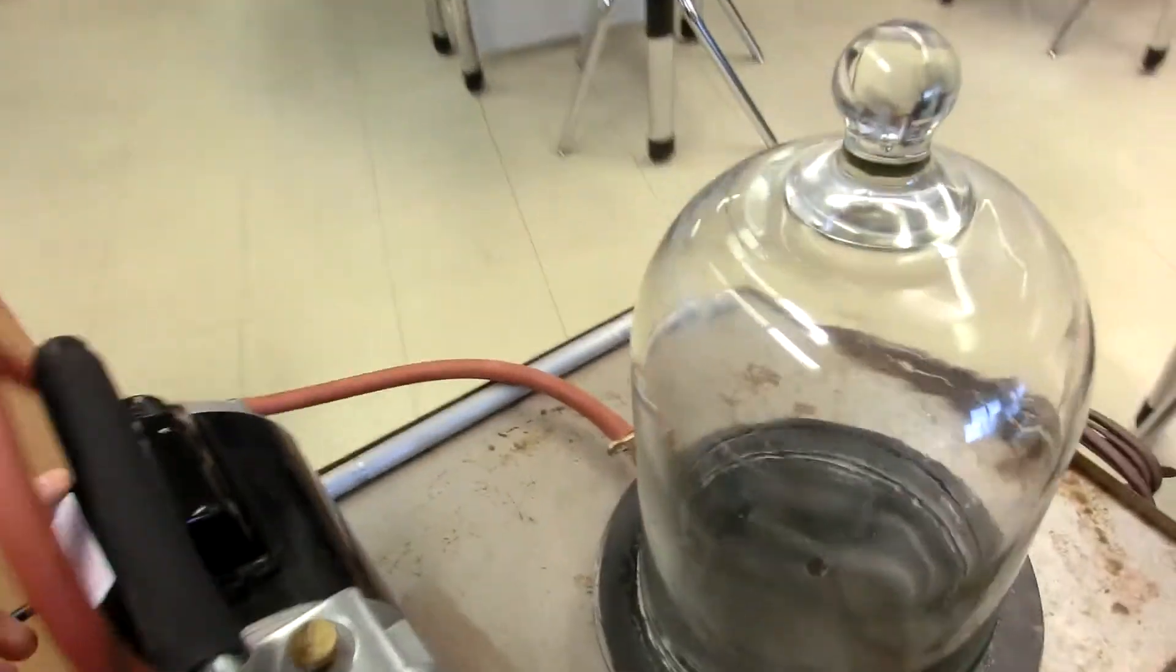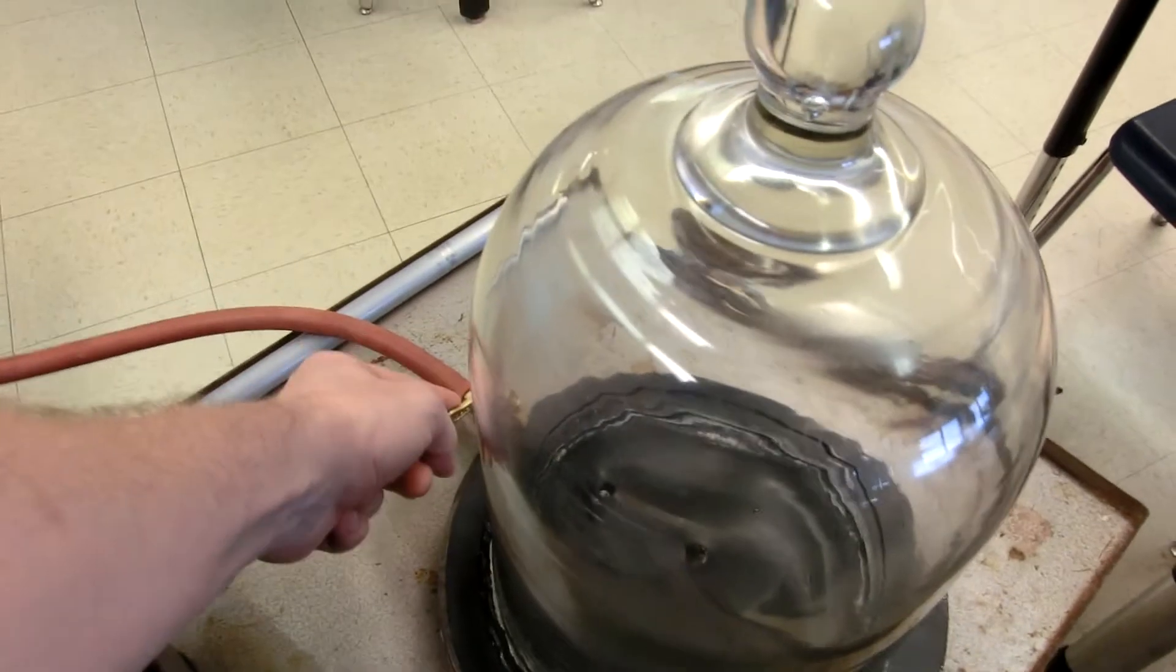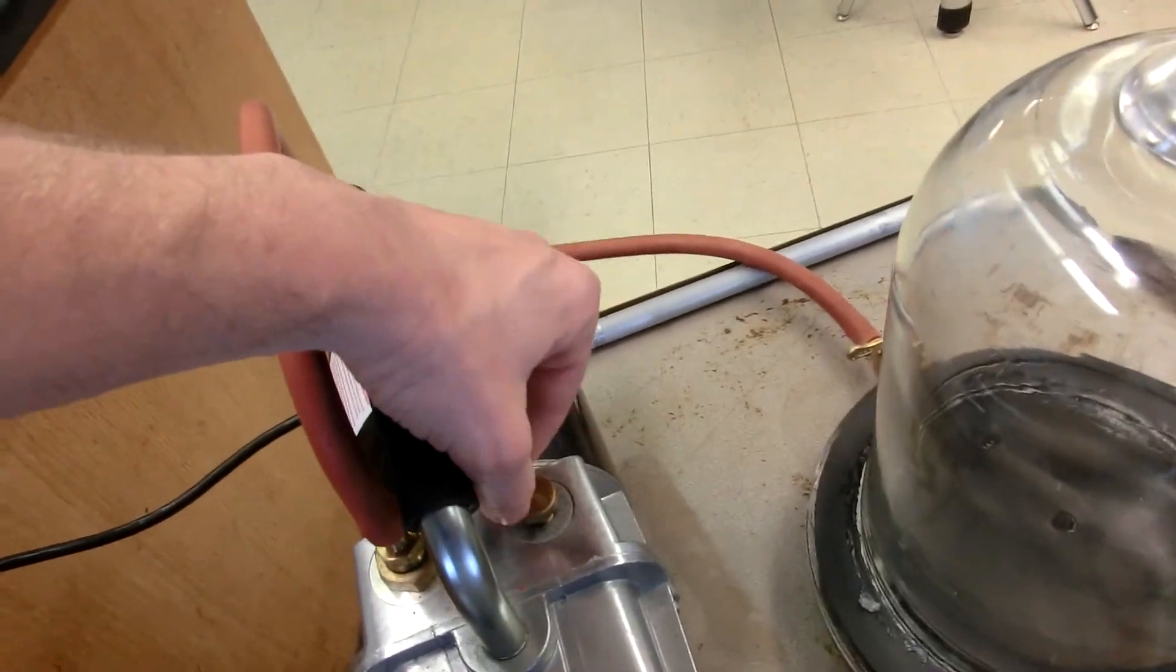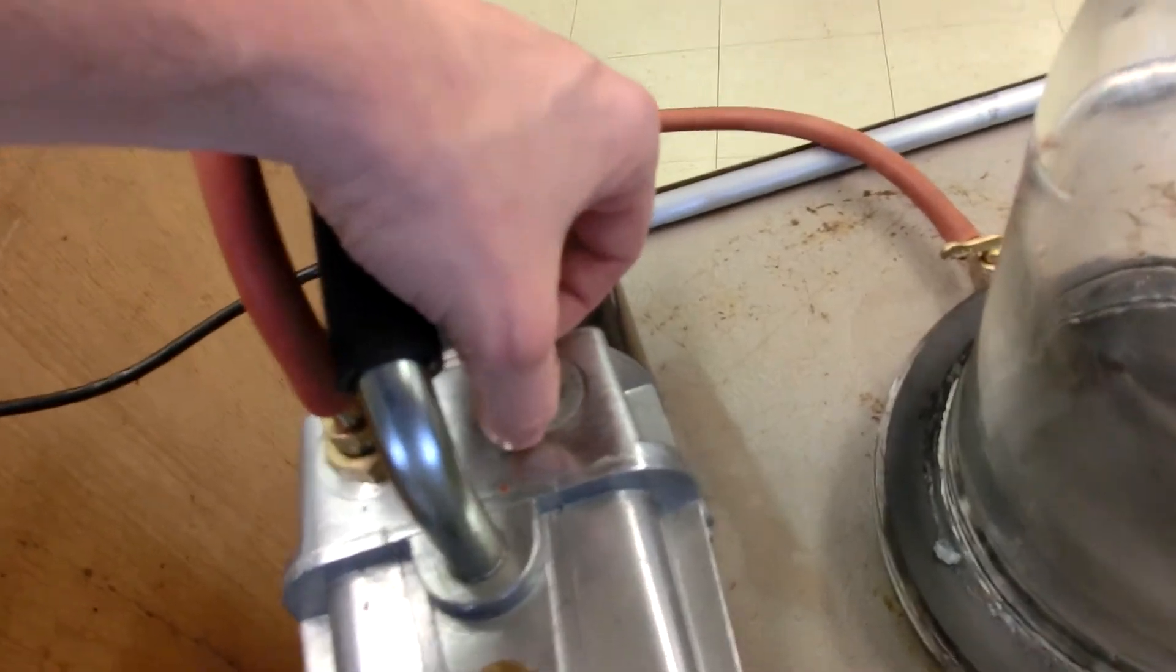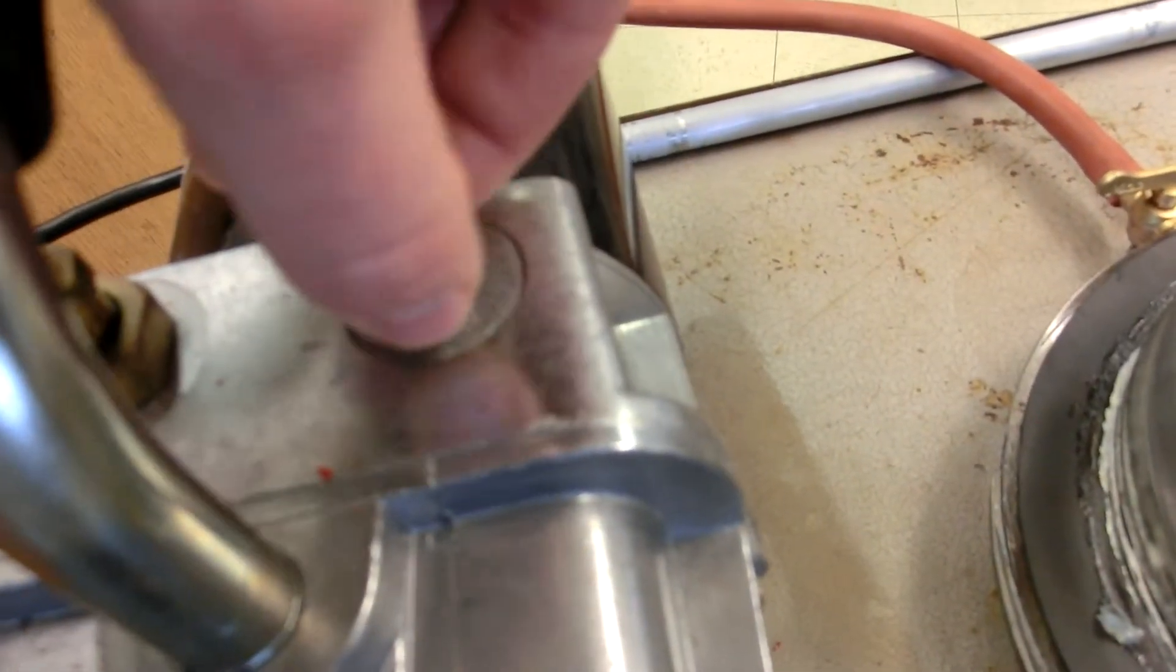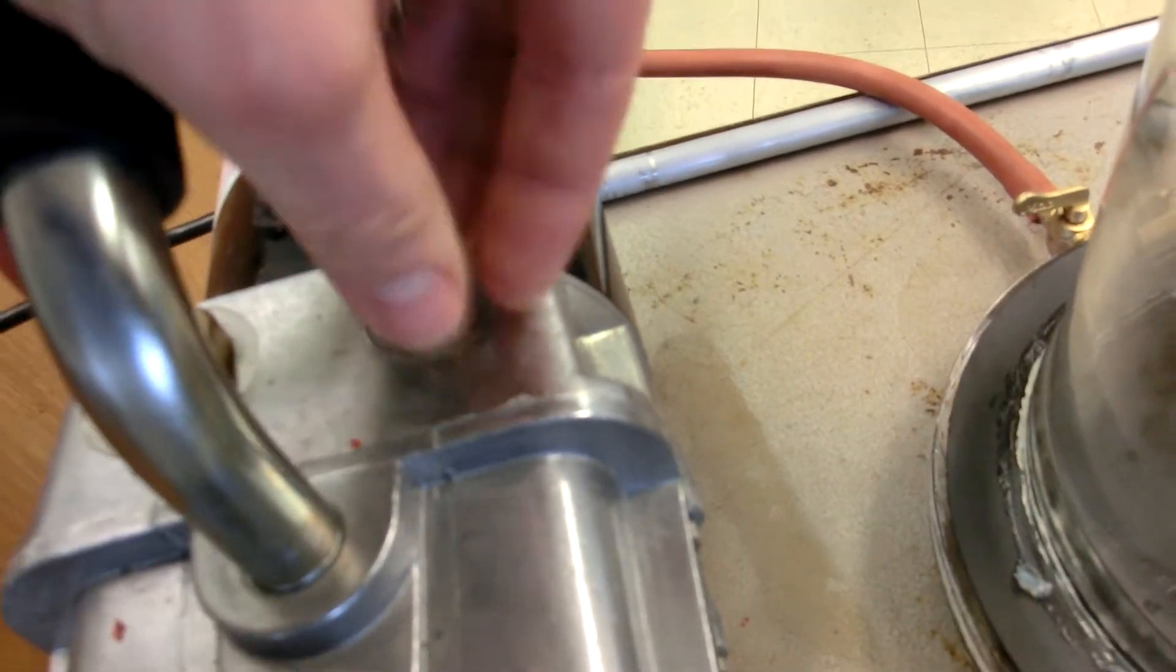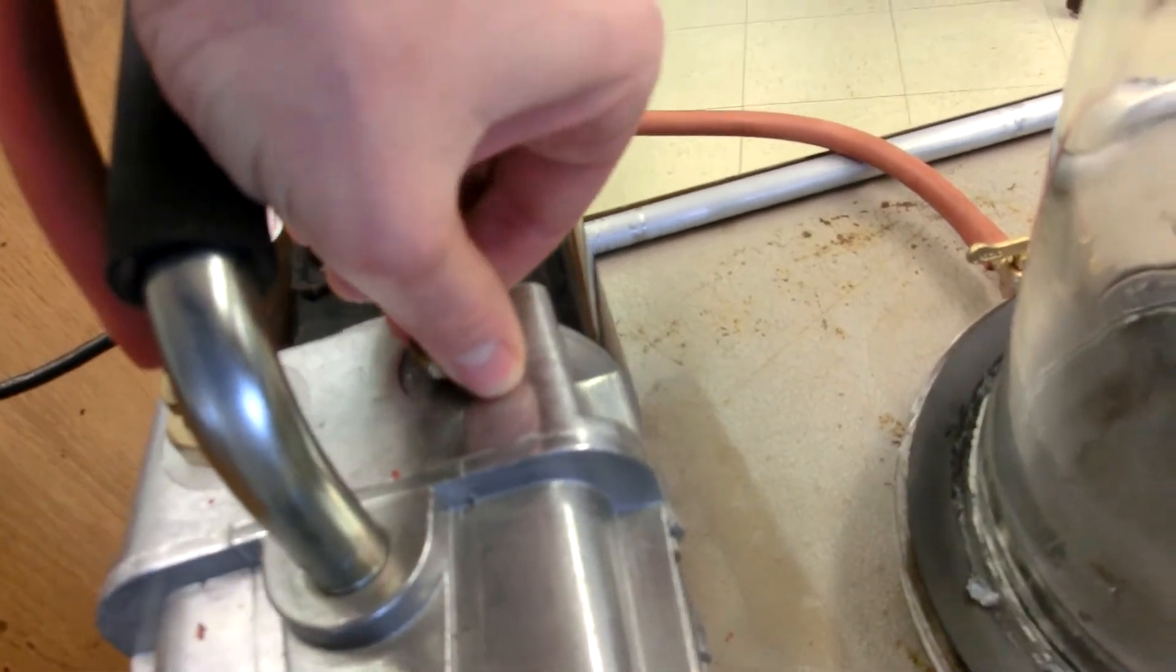So once again, after you shut it off, shut this valve and at this point we could actually release the ballast. Listen for it, so now the pump itself is no longer under a vacuum.